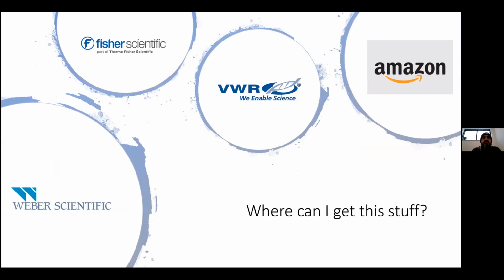So lots of places you can get this stuff. Consistently, the more expensive outlets tend to be places like Fisher or VWR. There are certain things that we get from those outfits that are very specific to labs, so you can't necessarily escape the science suppliers. Weber Scientific has always been very good too. They have pretty reasonable costs for a supplier. But always check Amazon too, or just search the internet, or go to the grocery store. There are certain things you can get at the grocery store that are useful in the lab.